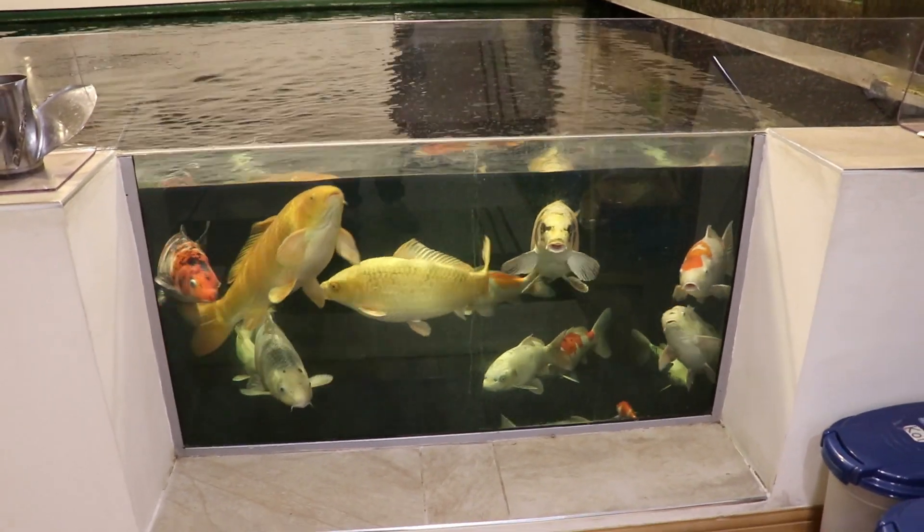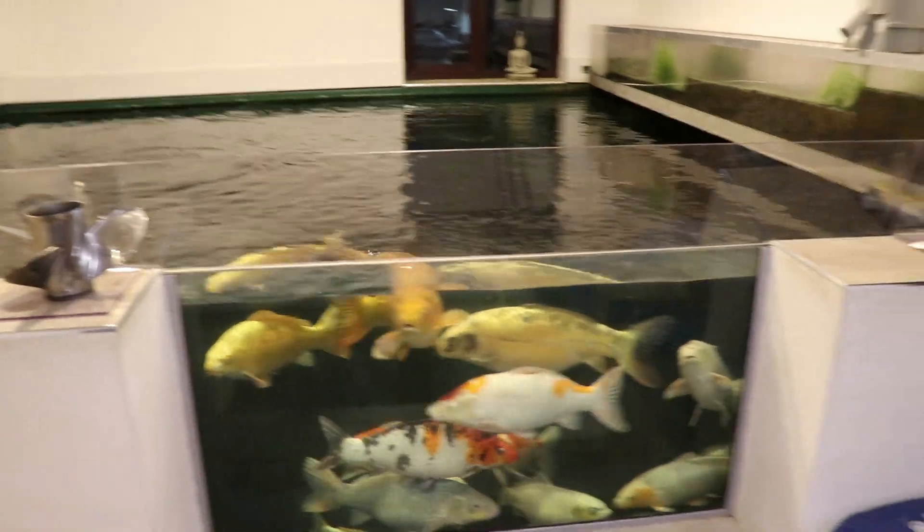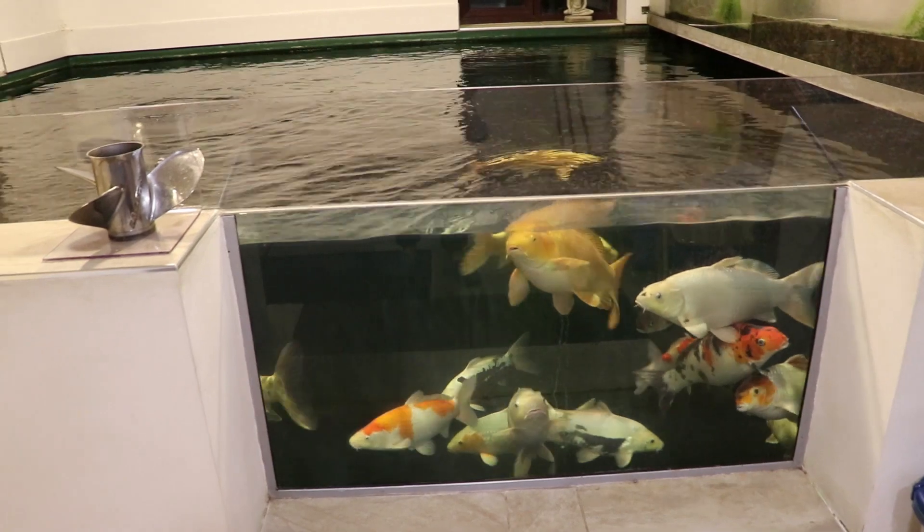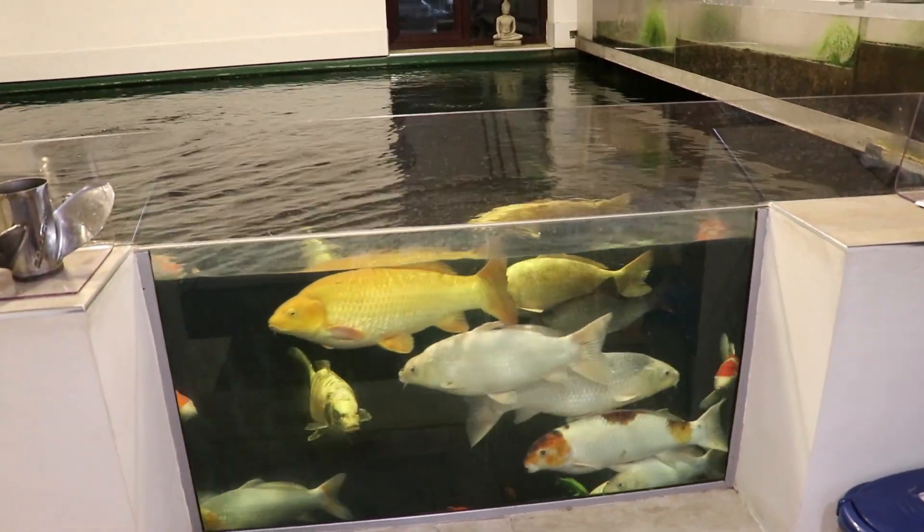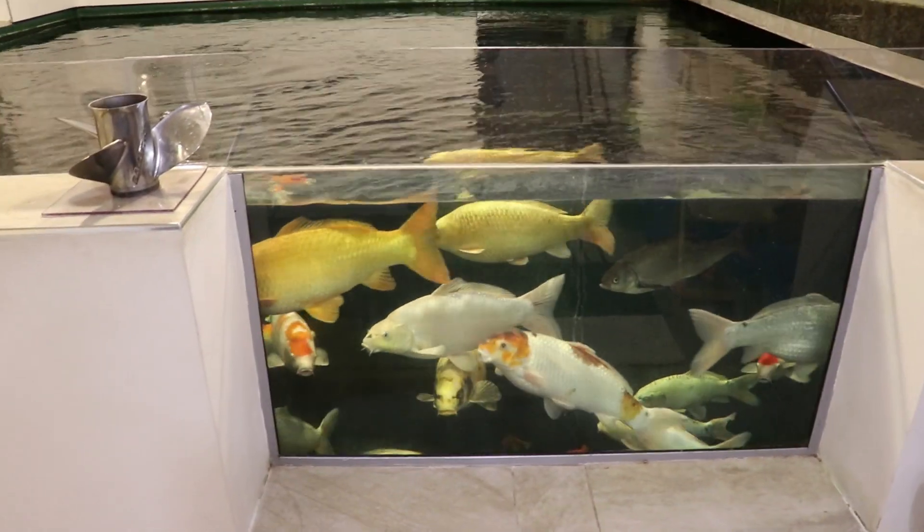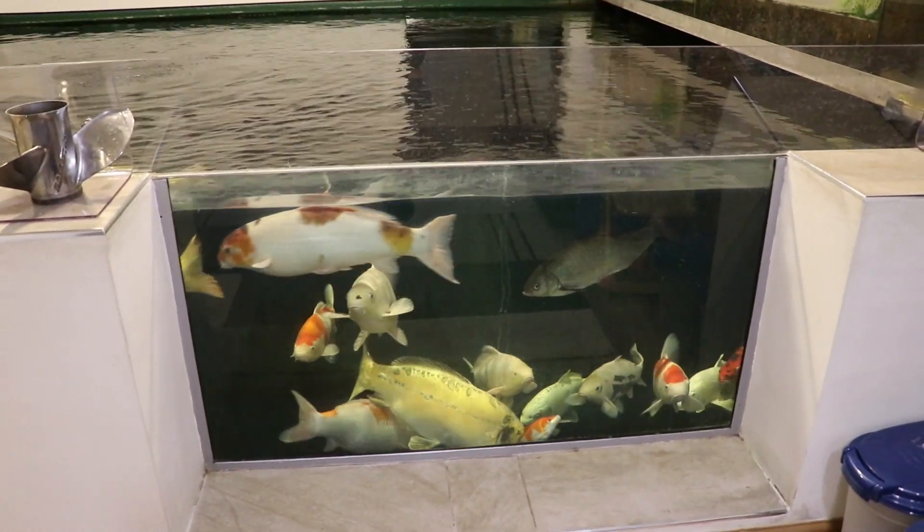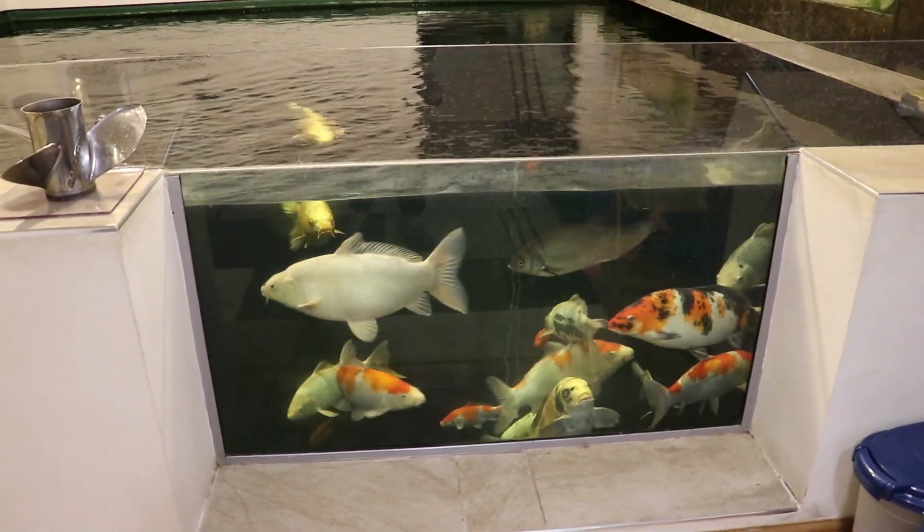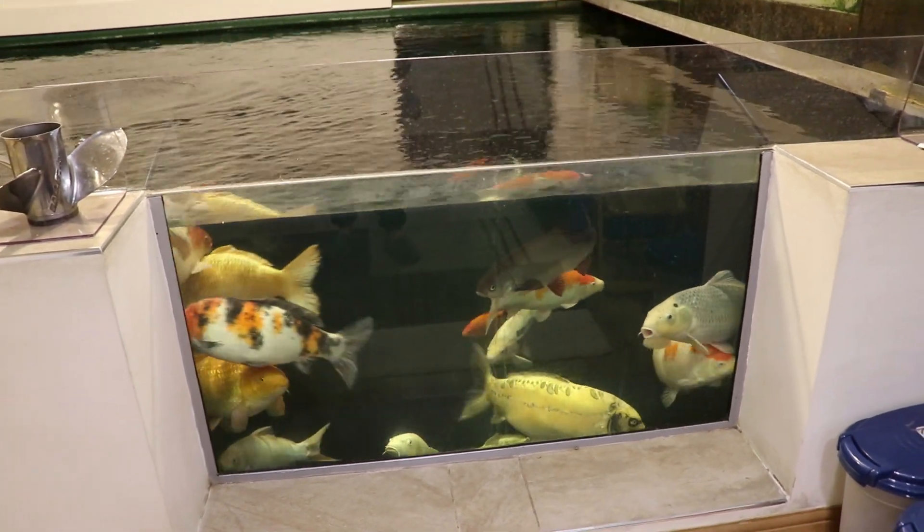There's nothing more frustrating, I've had it myself, where you're not sure that you're actually good enough to use the microscope but you've managed to scrape a fish and you can't find anything, but you're not sure if there is anything there or there's something there and you just didn't know what you were looking at. So this part is going to show you how to find things in the pond. There are always microscopic organisms in every pond, and in this video we'll see quite a number of them.